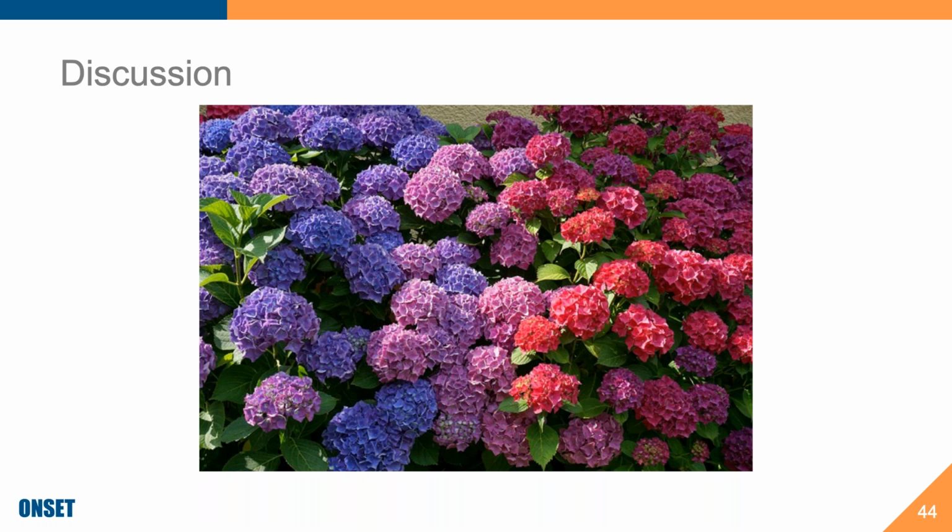Good question, Josh. How does the solution recondition the probe? It does that by rehydrating. It's a really cool dynamic between the internal and external gel layers, and that is they have a specific ion concentration in those tiny, microscopic layers, and the internal electrolyte has a specific salt content, and the storage solution has a specific salt content as well. So what it does is it reconditions those layers to have the right amount of ion concentrations that it's pulling from those salt concentrations. So that's how it reconditions it.